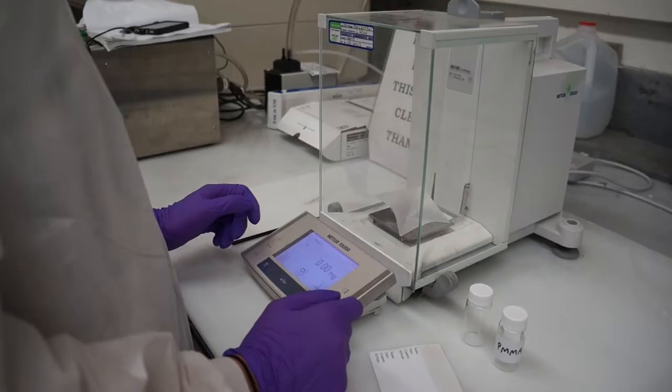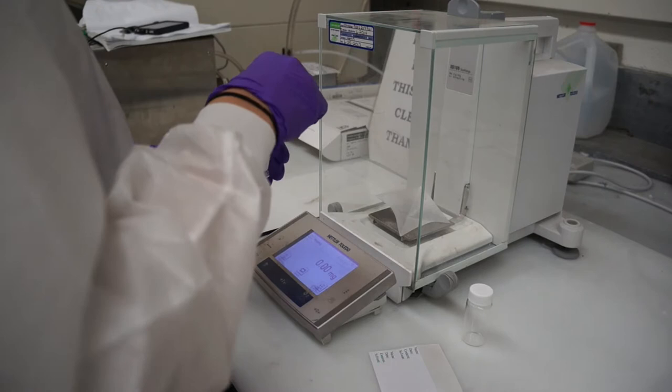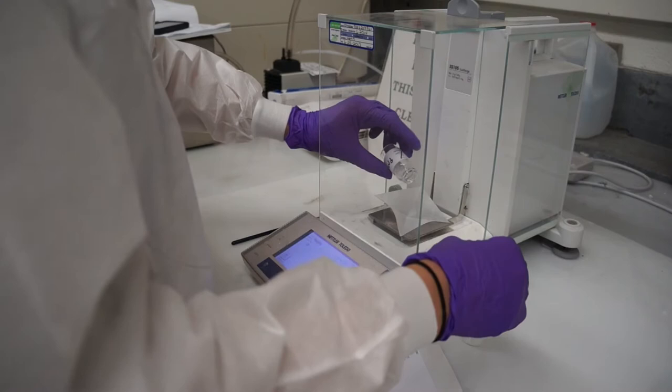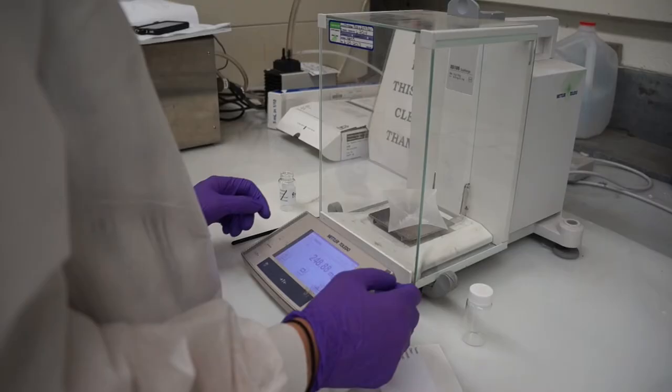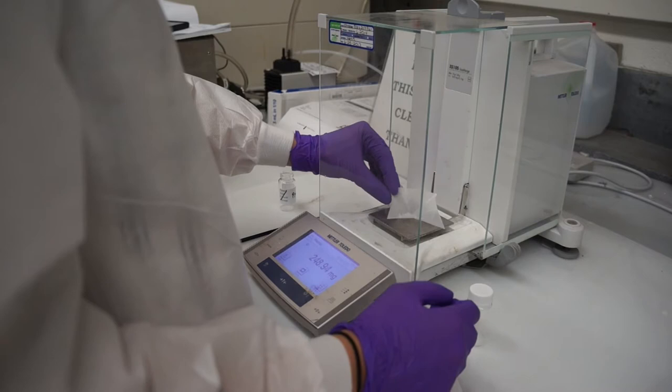You're going to be weighing out 300 milligrams of PMMA. Make sure to close the doors of the scales for more precise measurements. The reason we're doing this is because 20 milliliters of volume fits comfortably in a scintillation vial, and we're looking for a 15 milligram per milliliter solution of PMMA in toluene.